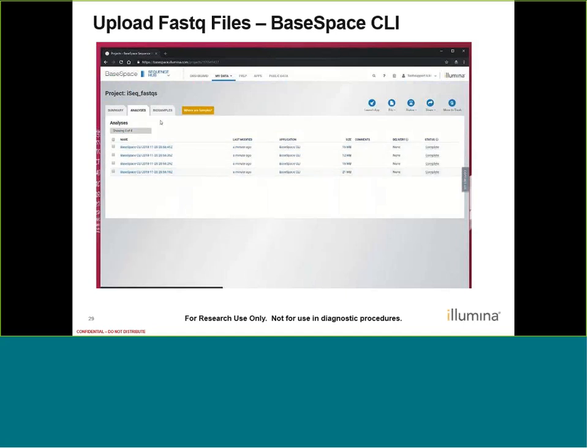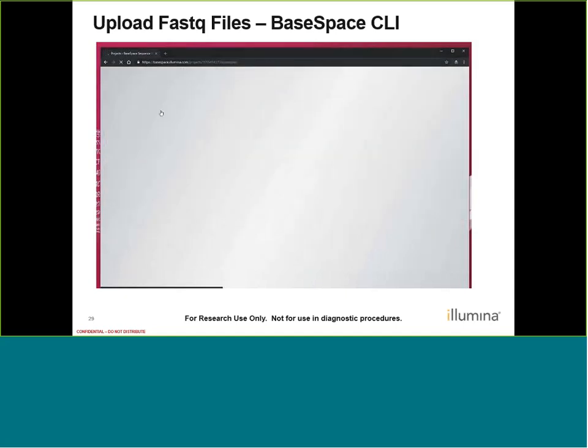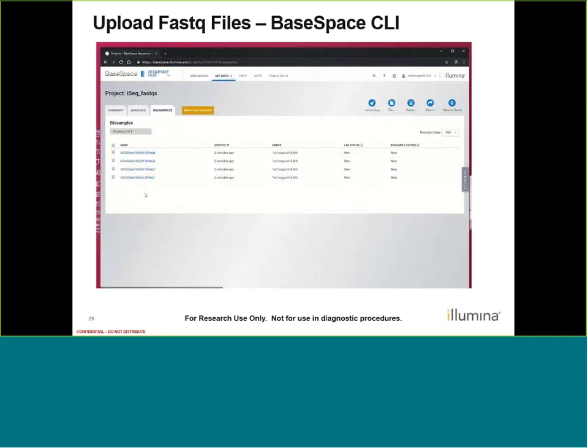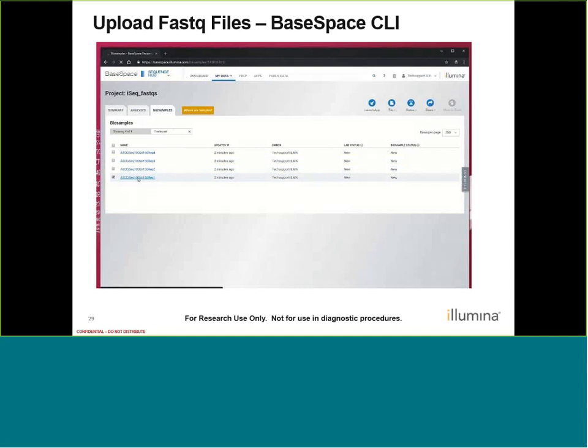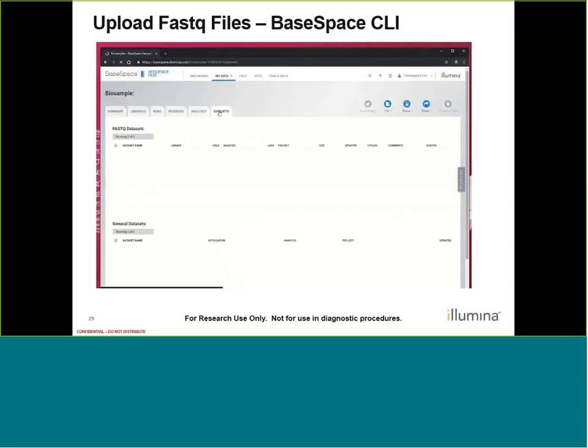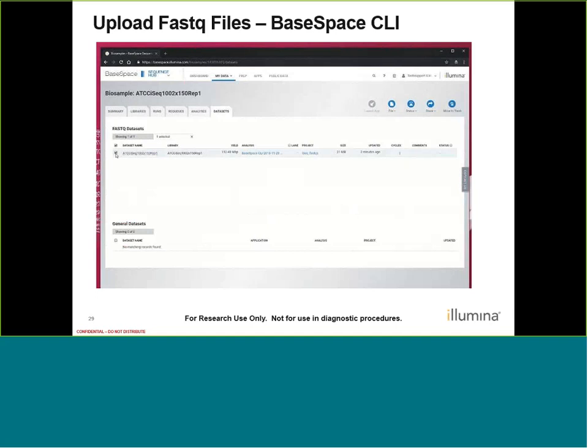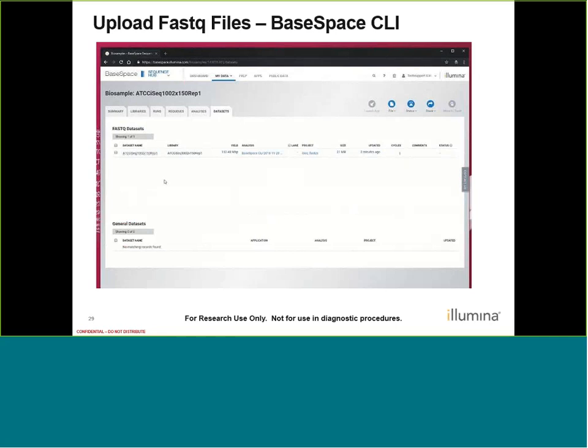Let's see what this looks like on BaseSpace. You will see these at BaseSpace CLI analyses, and each analysis belongs to one file. I can go into the bio samples, go to datasets, click on my dataset, and see that I have my R1 and R2 FASTQ files for this particular sample. It's really quick to upload files — so much faster than uploading one at a time on the BaseSpace UI itself. You can do this directly from your instruments — for example, if you're using a benchtop instrument and use Local Run Manager to generate your FASTQ files, you would be able to use these scripts to do exactly this upload just as quickly.